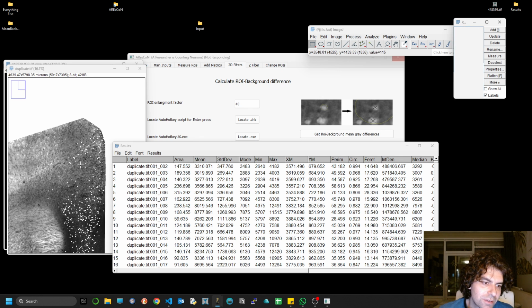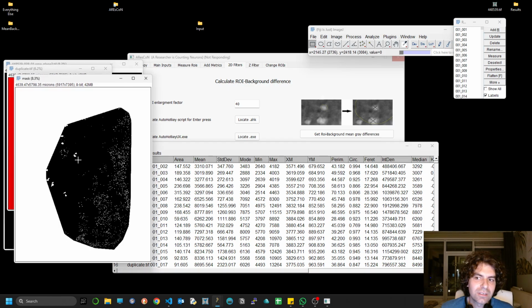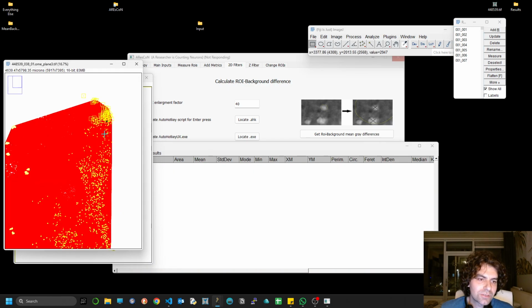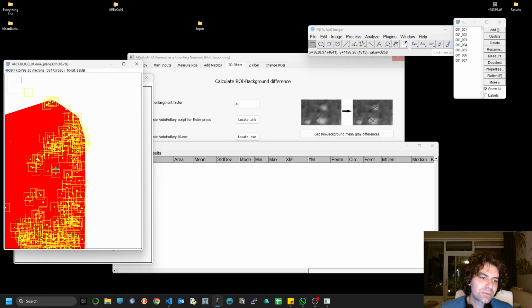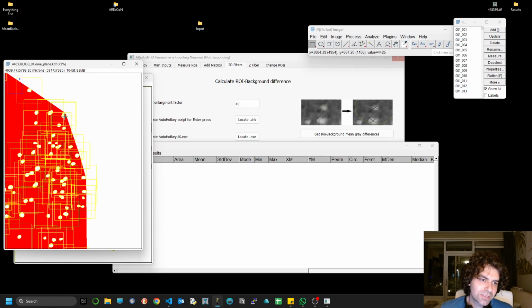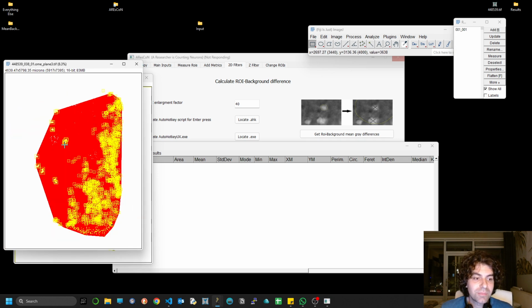You're not taking the background that's outside. It's not possible to take the background that's outside the brain anymore, because everything else has been whitened out. That's the beauty of it. And now let's zoom in, for instance, on this particular observation. We have this square, so we're taking the mean background, but we're excluding this, and this, of course. And we're doing the same everywhere, also for the cells that are close to the edge. This is not going to be included anymore because we've successfully managed to take it out. Okay, pausing the video and getting back after everything is updated.